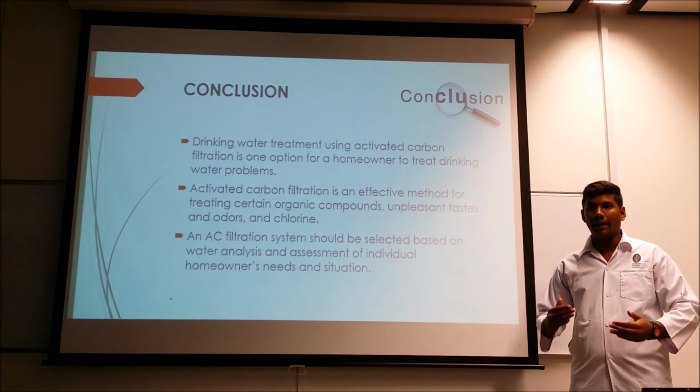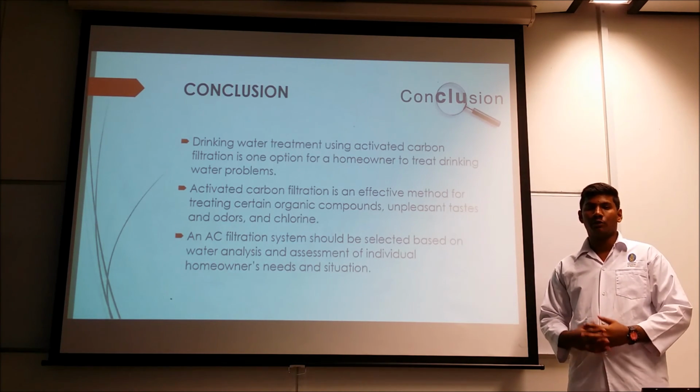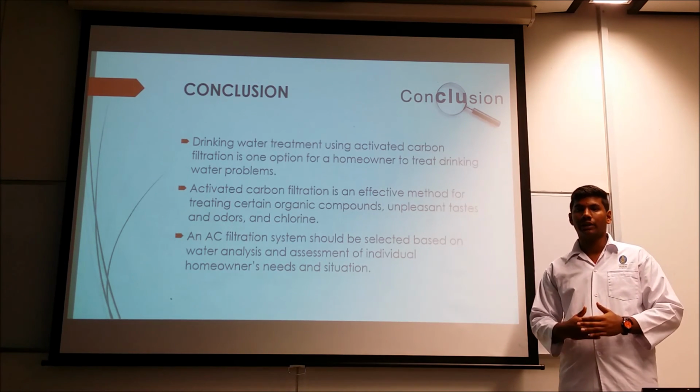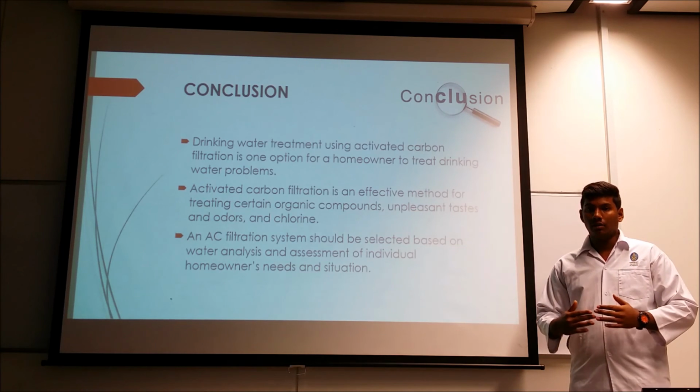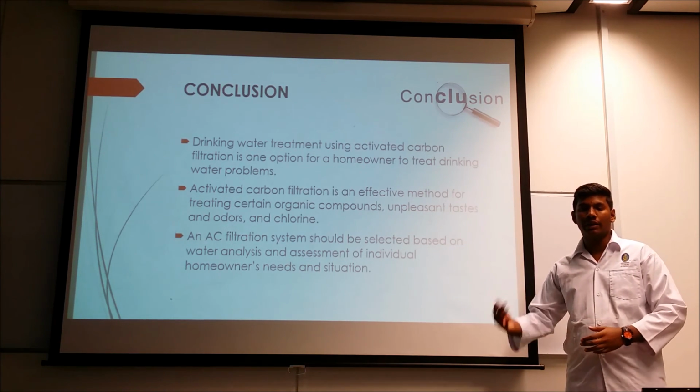Before I end this video, we as a group have found out that activated carbon is one of the good solutions to do water treatment and to get clean water.